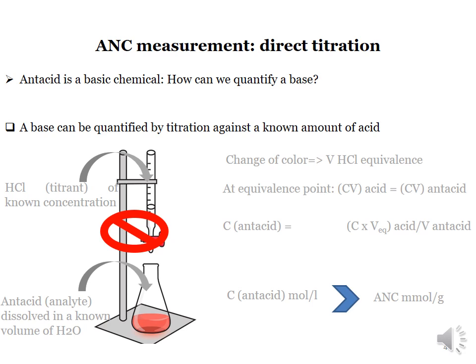But I just want to tell you something: this method doesn't work at all. The reason why this method doesn't work is in the coming slide. Just to tell you, direct titration for antacids doesn't work. So what are these limitations when using a direct titration of an antacid?